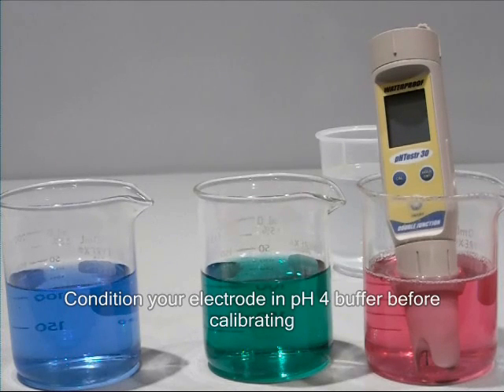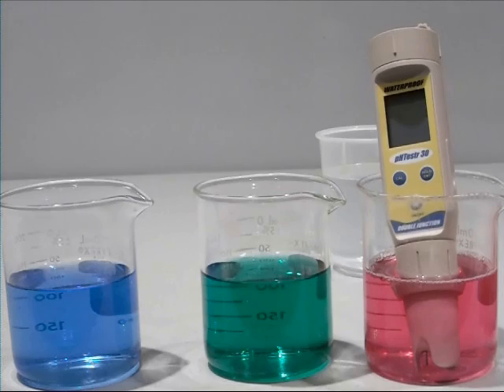Before you begin, condition your pH tester electrode by immersing it in electrode storage solution, pH 4 buffer, or tap water for at least 30 minutes before use. Do not use deionized water.